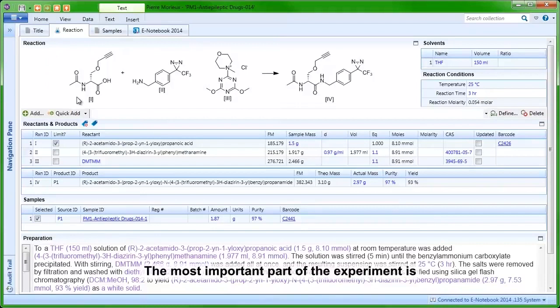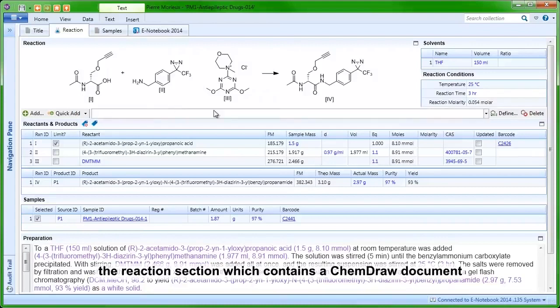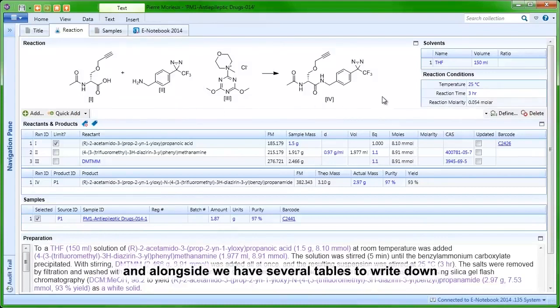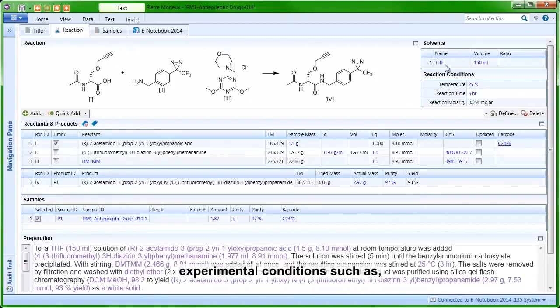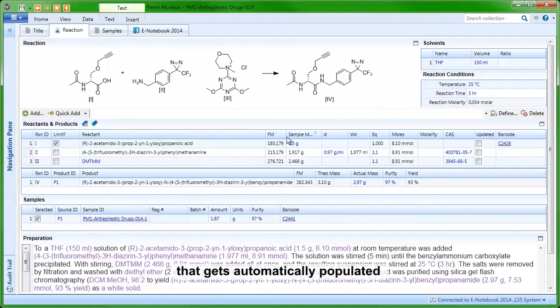The most important part of the experiment is the reaction section, which contains a ChemDraw document as you may recognize it. Alongside we have several tables to write down experimental conditions such as solvent, temperature, and reaction time. Below we have a stoichiometry table that gets automatically populated based on the molecules drawn above it.